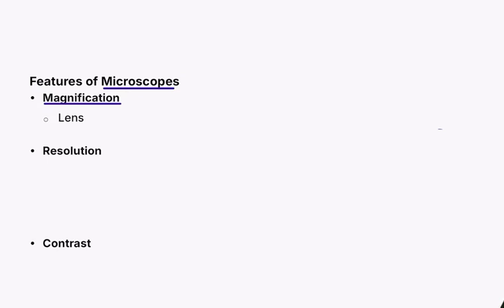But what's also important is that despite having a lens system, a beautiful picture always comes when you add some filters to it. So similarly, in a microscope, for you to see a better picture, you need to create a contrast. It's something similar to how you edit your pictures and change the brightness and the contrast, etc. Same way, if I want to see a more detailed image, I need to add a contrast, and that is with the help of adding some colors or dyes.